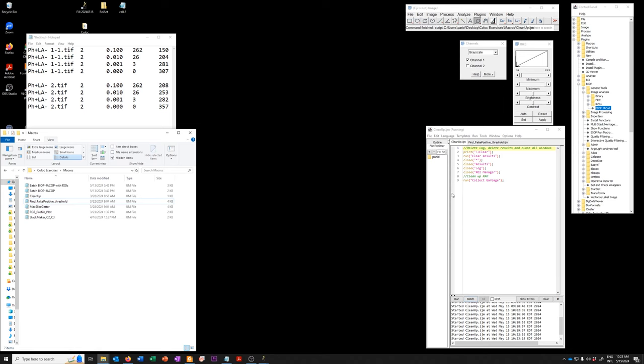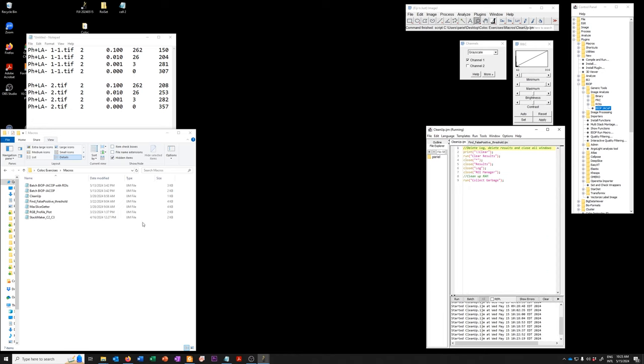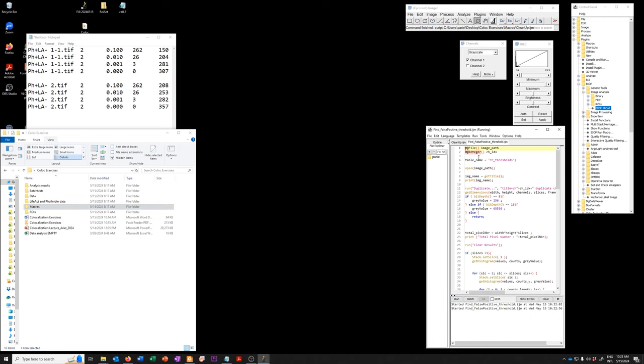And obviously you could write something to wrap this and have it loop through. I'm just doing a brute force approach right now. So I'm going to run it one last time.